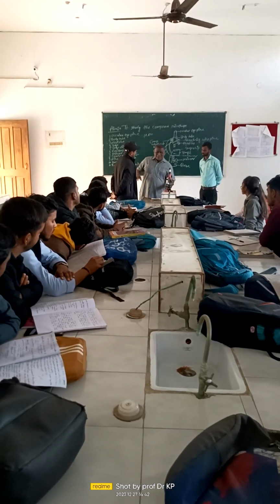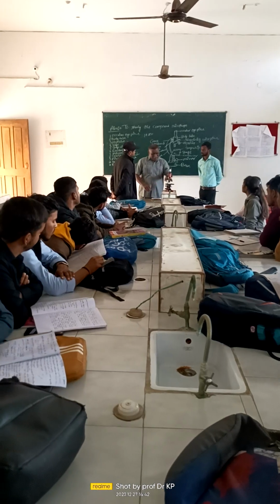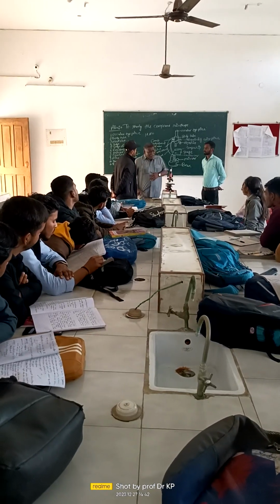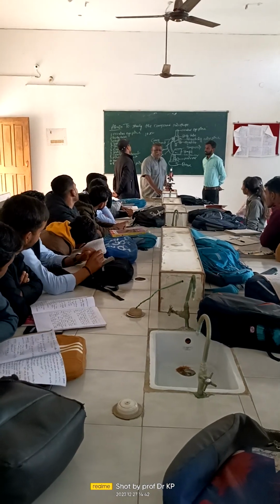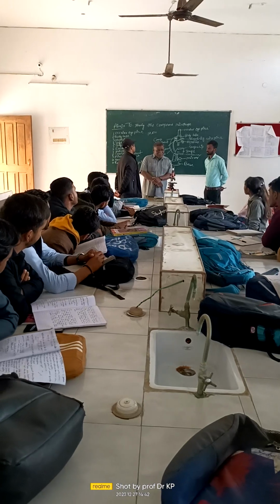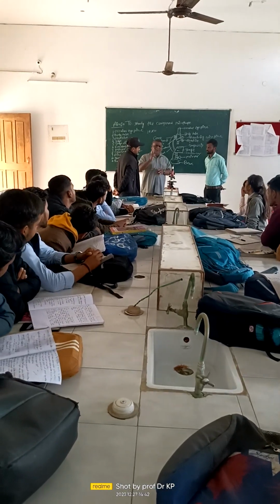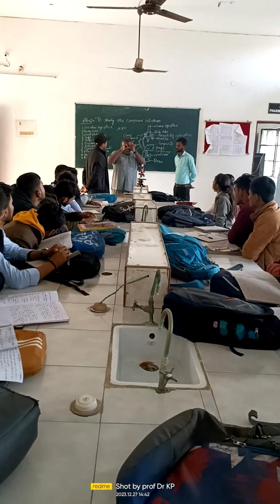Understand? Then came a lot of microscopes, the binocular microscope, then the light microscope. They say microscope when you use a natural source of light or artificial source of light, okay, it's a normal one. When you use an electrified or electronic light source, that bulb over there, that is a light microscope. You understand? After that, several generations are there, but usually in the educational laboratories, dissection, simple, compound, medical will be there. Apart from that, binocular microscope.